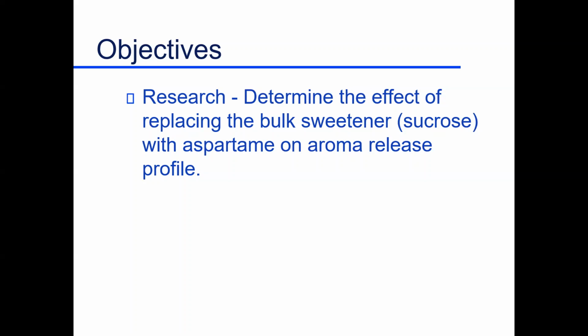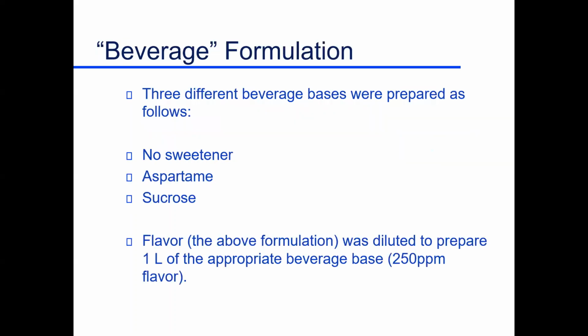Different example: determine the effect of replacing a bulk sweetener, sucrose, with aspartame on aroma release profile. Is a sugar sweetened beverage the same as an aspartame, a high intensity sweetened beverage? Do you get the same flavor profile out of it? Not really. It changes the flavor profile a lot, whether using a bulk sweetener or a high intensity sweetener. And so this is, again, a place for mass spectrometry.